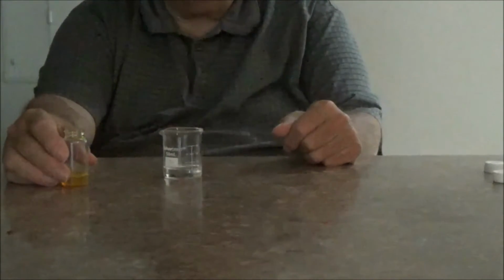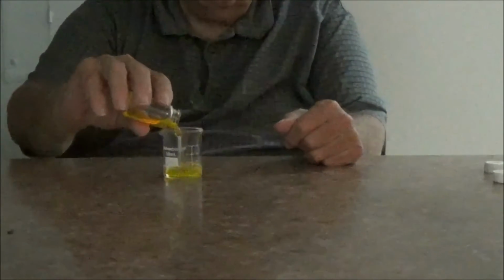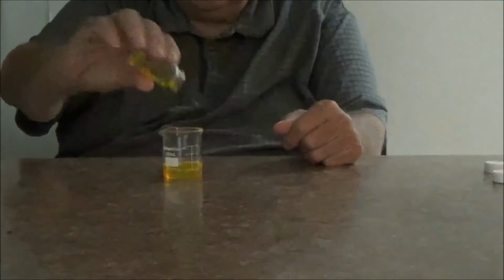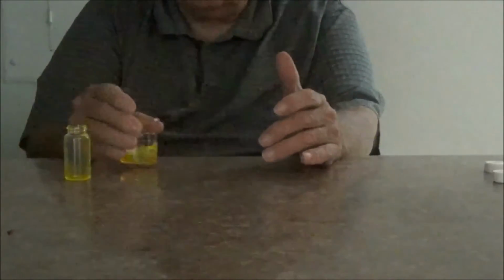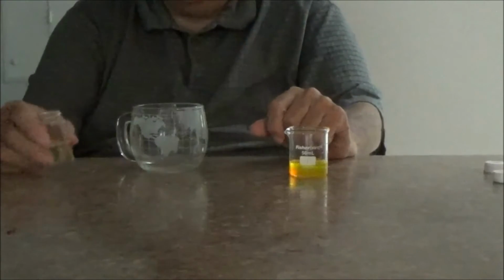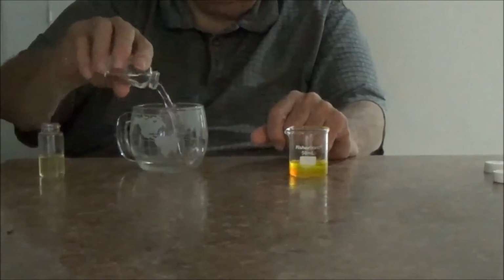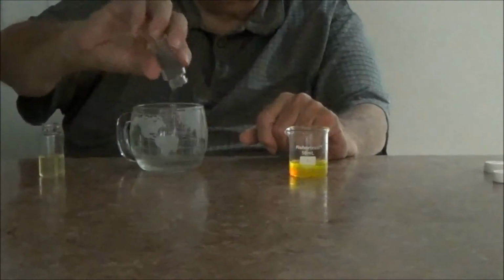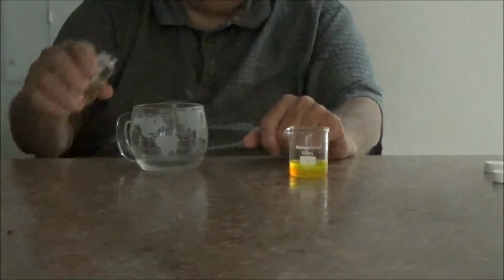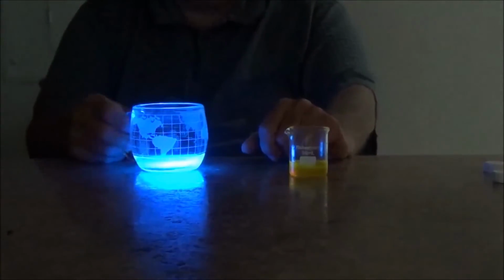Now we're going to pour in the actual activator, and it is lit up a little bit but not a lot, so I'm going to set these aside. And I'm going to pour in two other materials. First will be the activator, putting it in a little glass cup, and then there we go, the other solution.